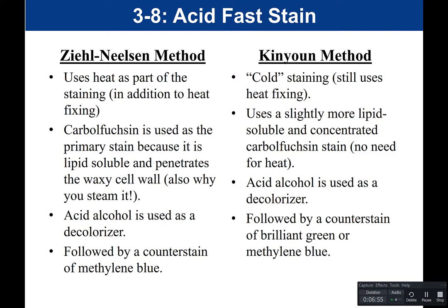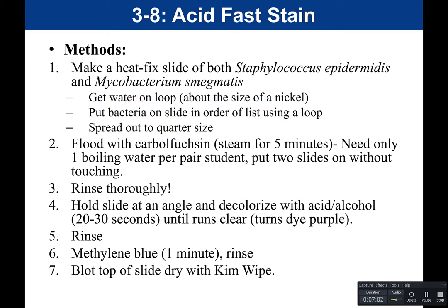So how do we do an acid-fast stain? We take a slide and add one water drop about the size of a nickel using a loop. Then we add the bacteria — in this case we have two: Staphylococcus epidermidis and Mycobacterium smegmatis. We add Staphylococcus epidermidis first and Mycobacterium smegmatis second. For this one, we use a loop to add the bacteria because Mycobacterium smegmatis is very sticky and it's difficult to get it off the loop.